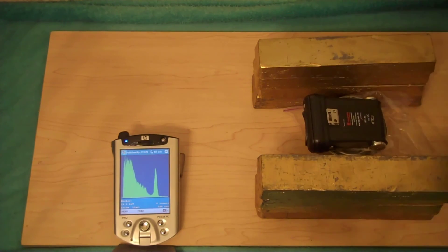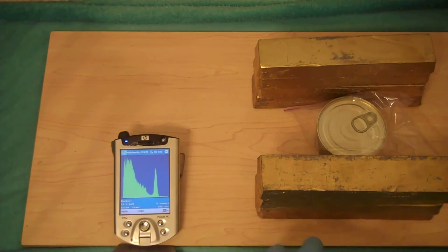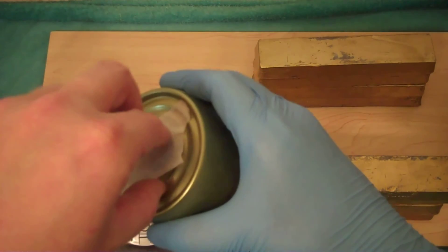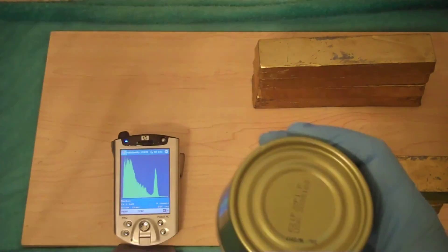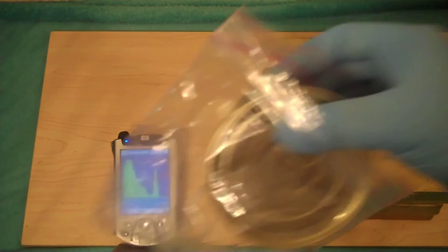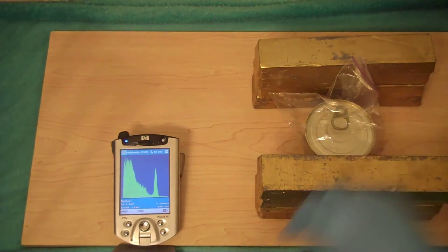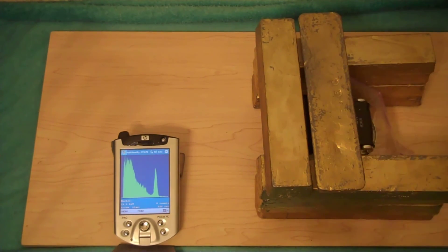Let's pull this off and take a look at this can of food that's so terrible and radioactive. Wait a minute — what's that? Ignore the man behind the curtain. That looks like a Caesium-137 check source. The food's not really radioactive — I was lying to you. I wanted to show you what it would look like if it were radioactive. Obviously, if you've got some oysters from northern Japan, they might actually be radioactive and you might actually see that for real, including maybe a Caesium-134 peak as well.